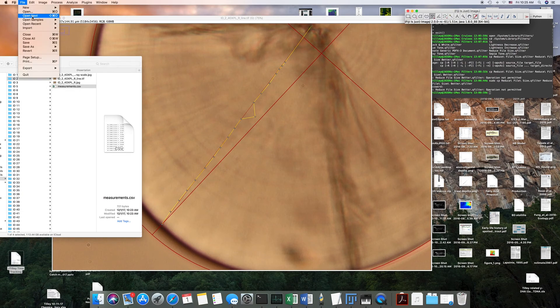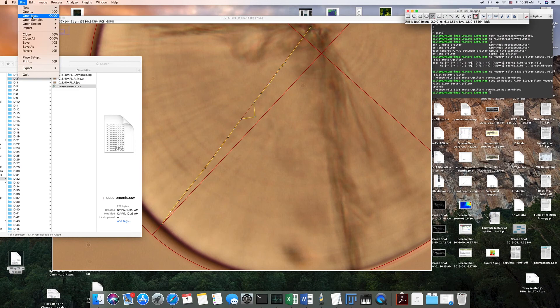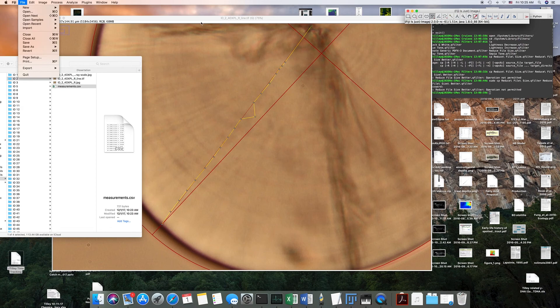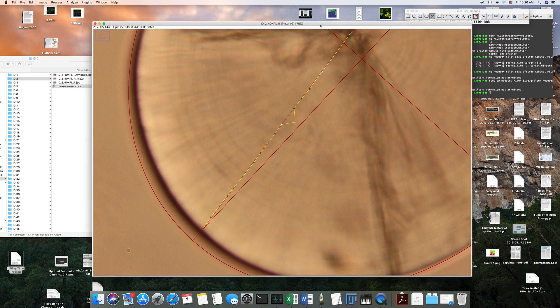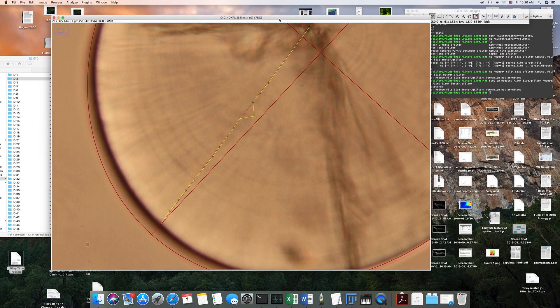But if we had all the images we wanted to do, it's kind of easier to just go up here and say open next. If they're in order, you can just breeze through them that way. Otherwise, you can just go to open and open up another image.